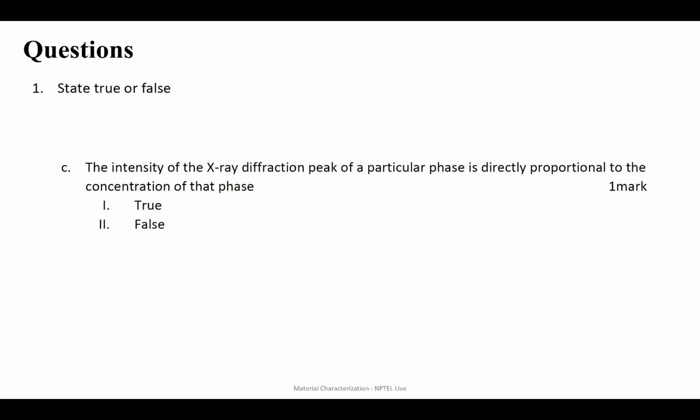The intensity of the X-ray diffraction peak of a particular phase is directly proportional to the concentration of that phase. True or false?